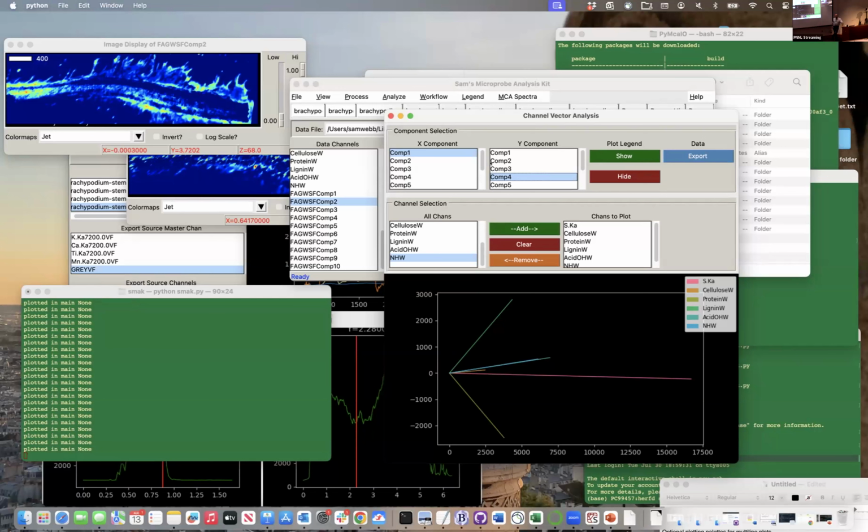So I wanted to add a comment, maybe on why someone would be thinking, why didn't you just take the Brachypodium stem back and keep it in the same orientation? And this is how all of our techniques also have their own subtle nuances. We simply map faster in the horizontal direction.